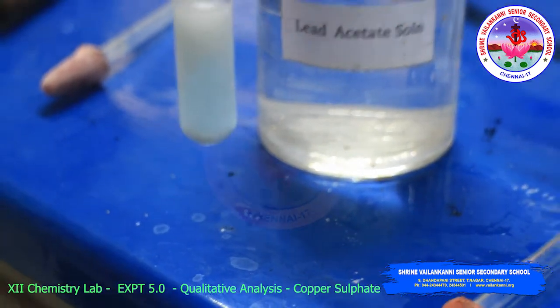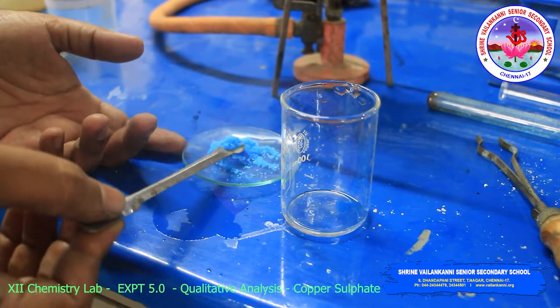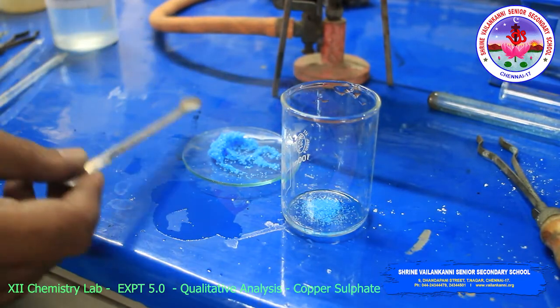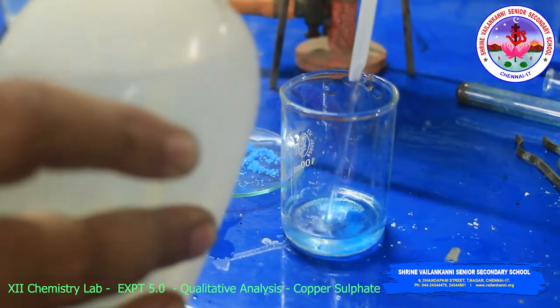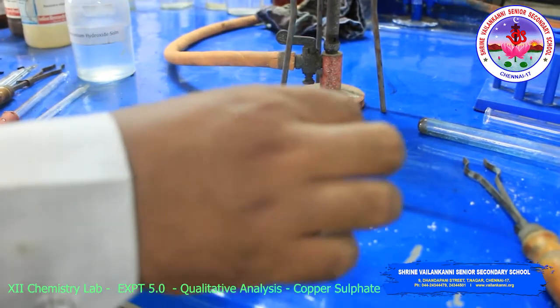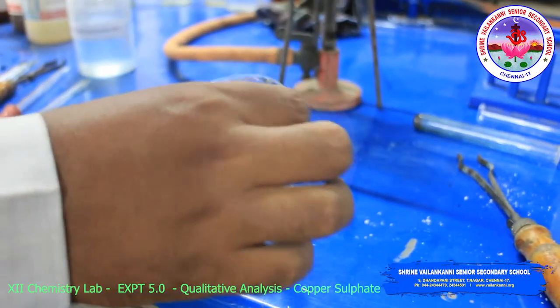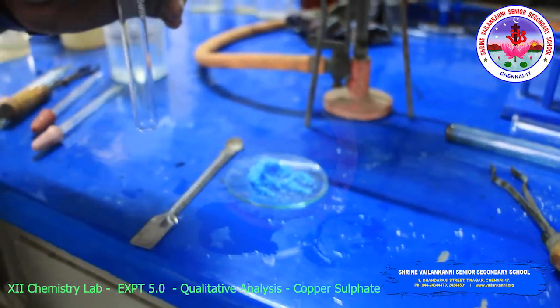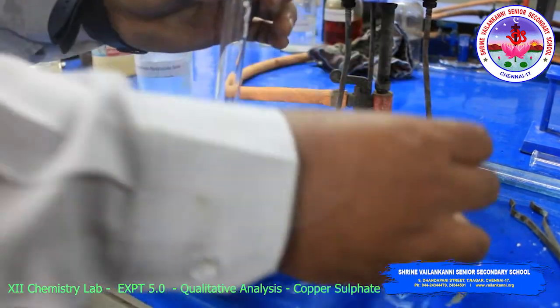Then we will do the basic radicals. For the basic radical test, first the preparation of the original solution. I am going to prepare the original solution: take a small amount of substance, add distilled water and dissolve the substance. Then take a test tube and transfer the solution into it. The solution is here.